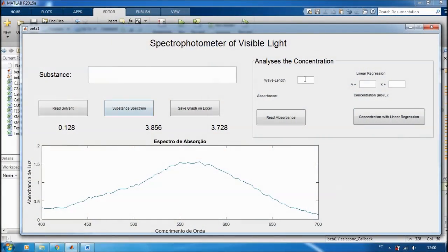With this interface, as well as with the outcome graphic, the user can see the peak of absorbance and make the analysis of concentration on the right wavelength.